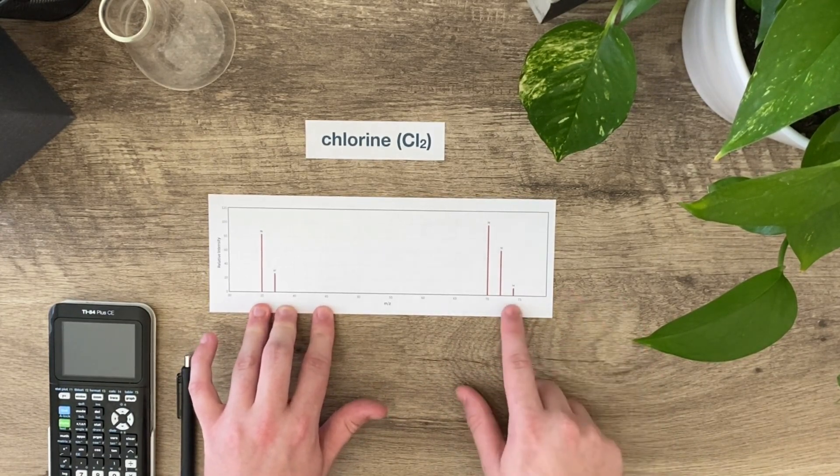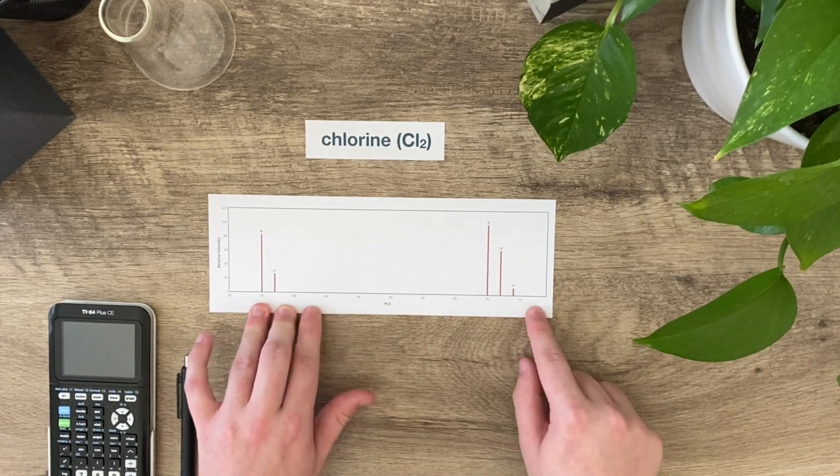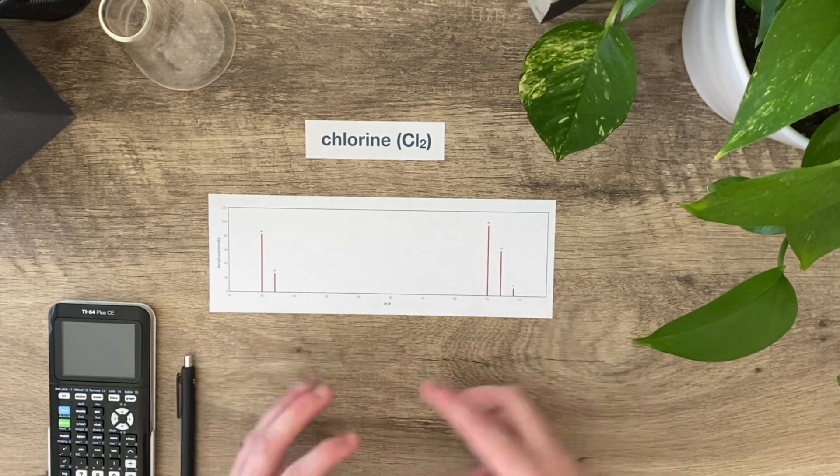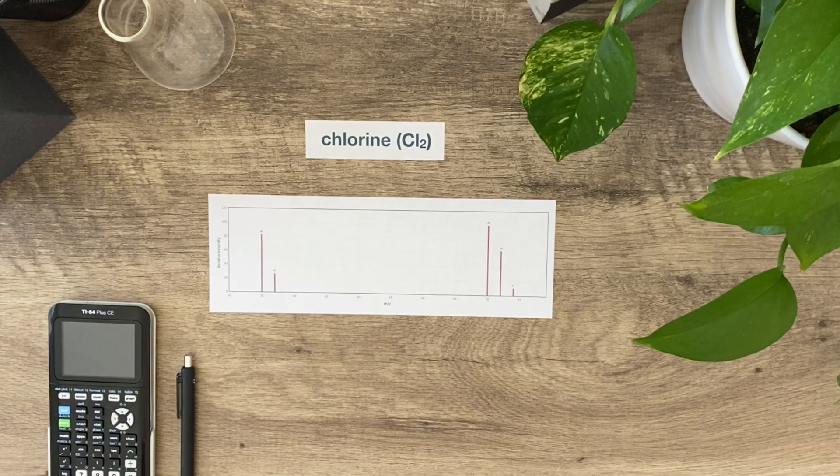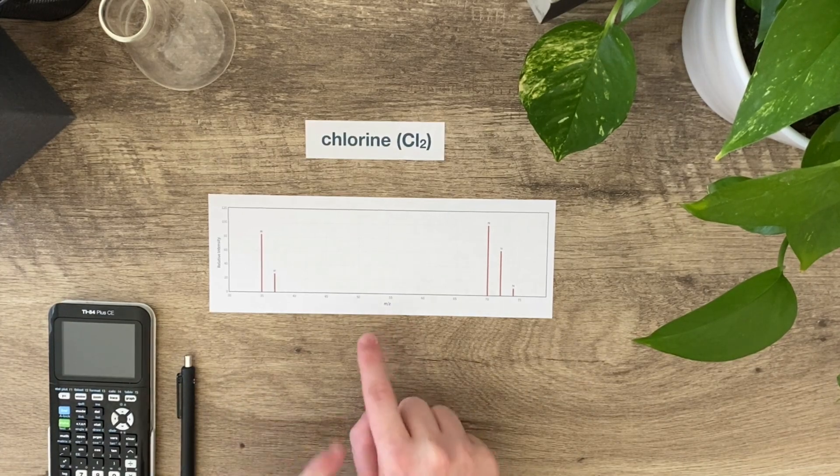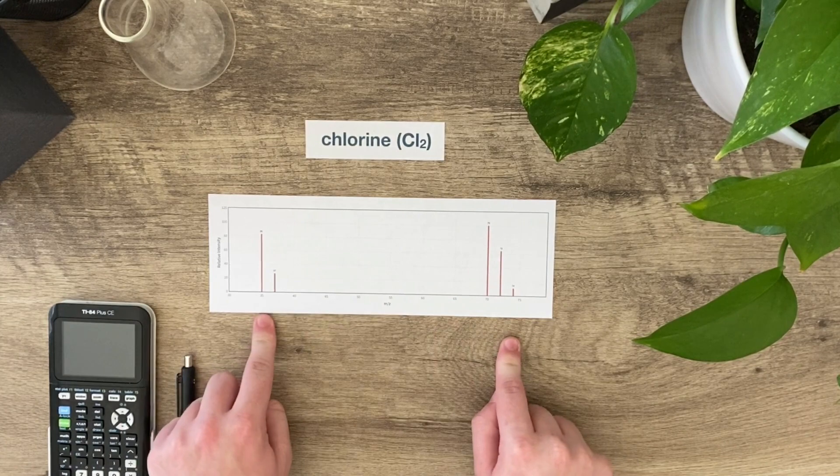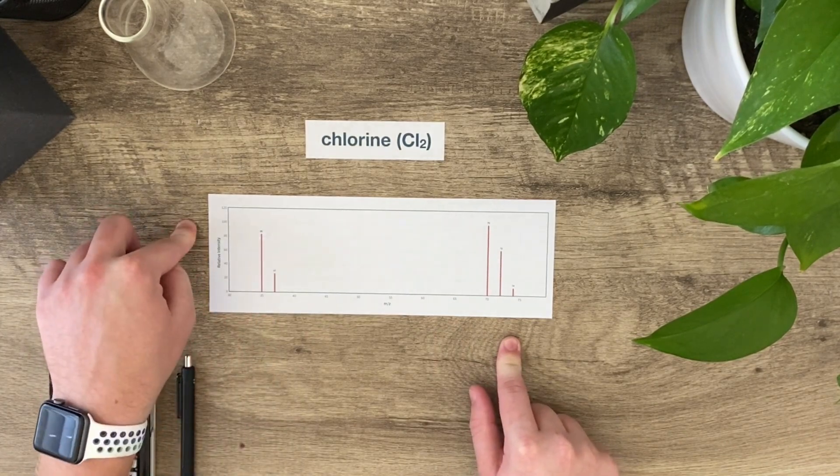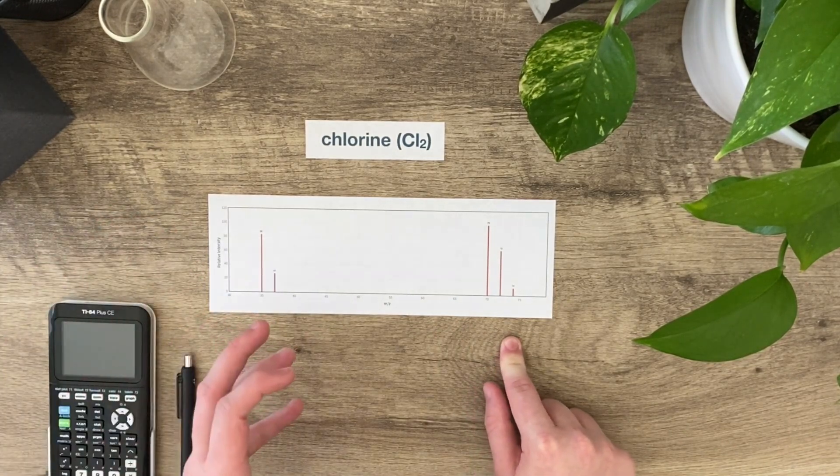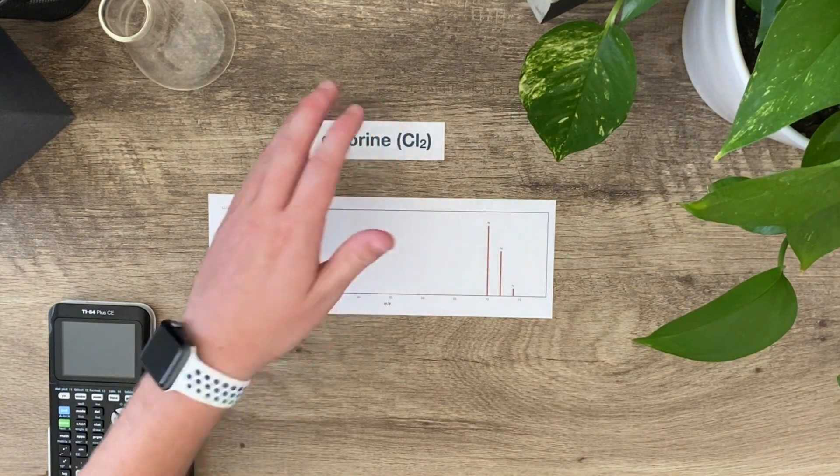We can see here based on this abundance how a sample should look if I get chlorine somewhere. Remember, m/z is mass to charge ratio, roughly the mass along the x-axis. Relative intensity is abundance, how frequent did that actually occur. Now let's take an example of how we could apply this to another mass spec.